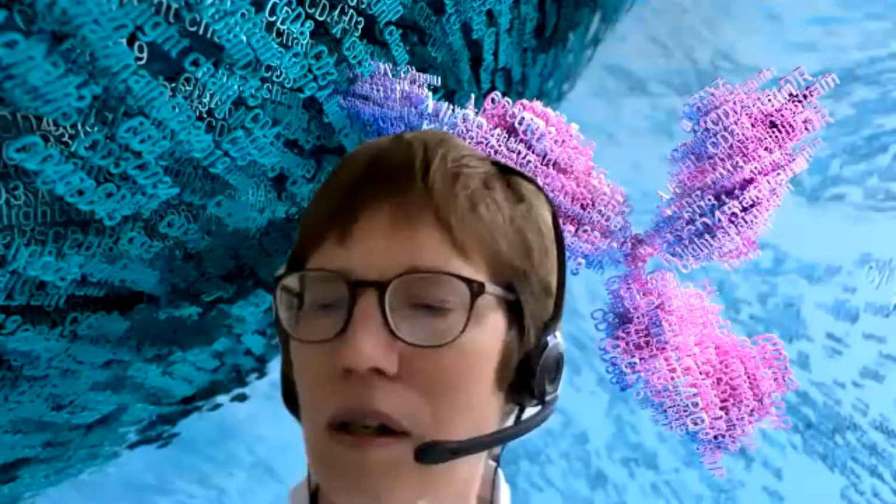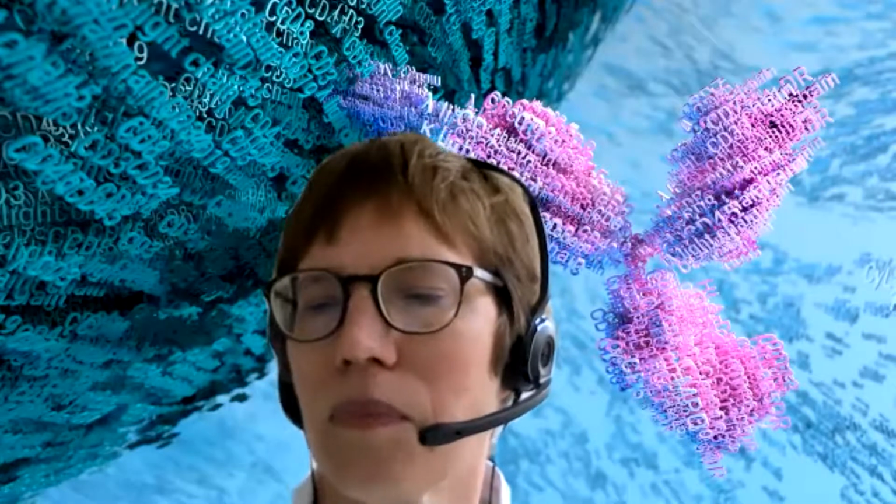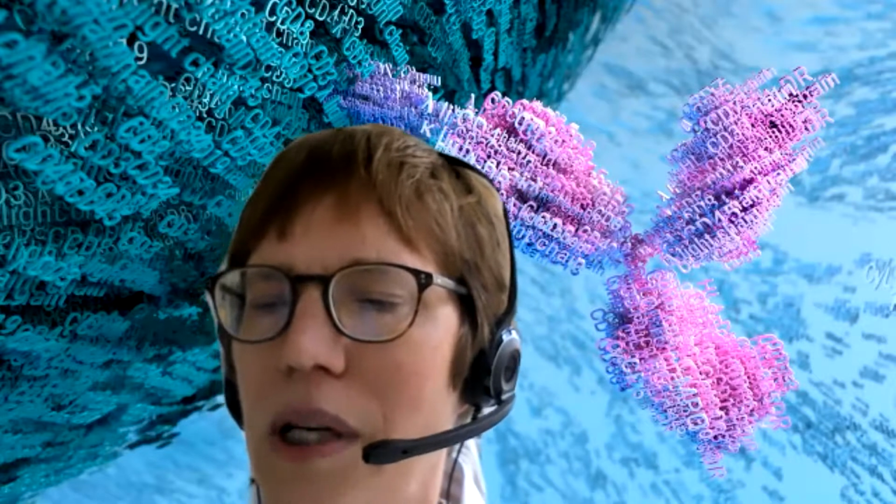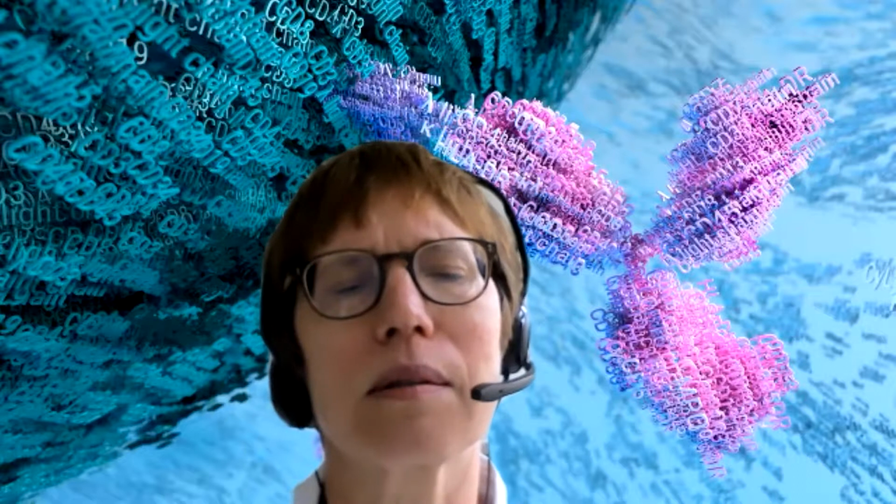Okay, there's another question that's come in. So the first one is, how does the rotor work with the centrifuge for lyse wash protocols? One of the slides showed it, I think. Yeah, so if you can describe it more. How does the rotor work with the centrifuge for lyse wash protocols?